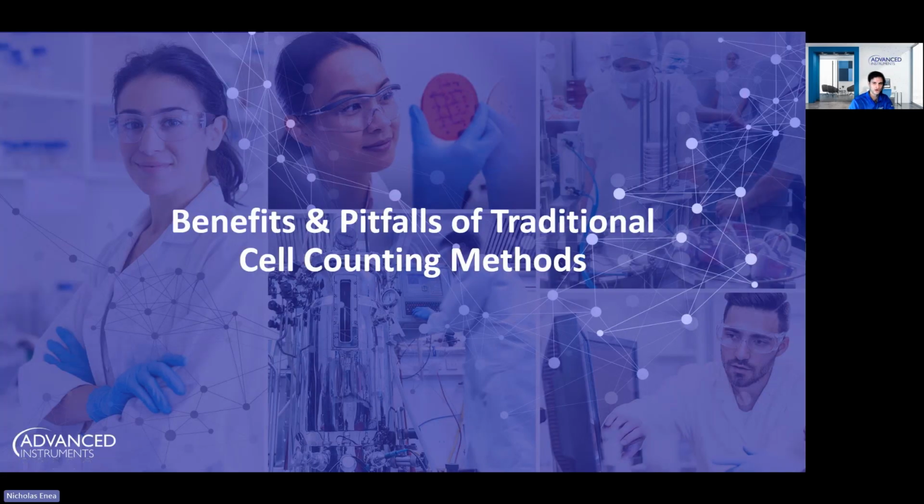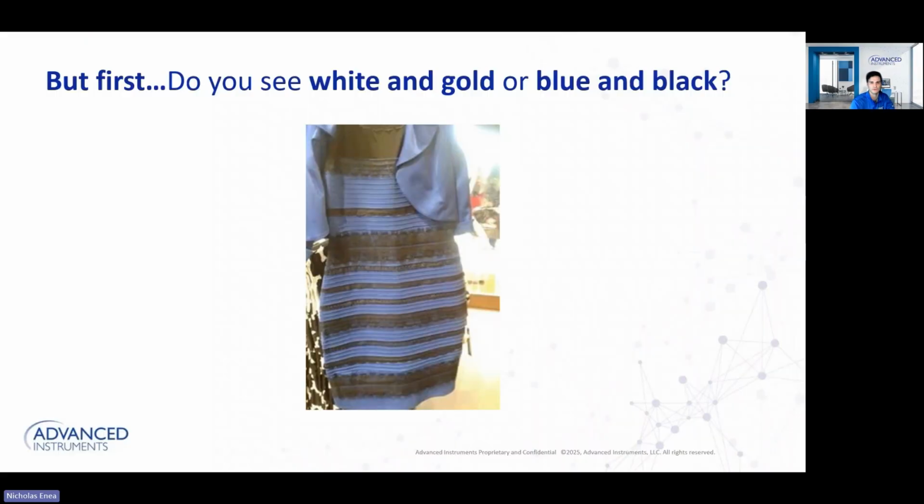Okay, let's talk now kind of the meat of this presentation and why we're here today, right? In a lot of the hospitals that we're probably in right now, you're using some of these methods. What are the pitfalls of the methods you're using, and how can the GloCyte help you here? I always like to do this activity because, and you're going to see it's a little kooky, but it's going to illustrate a point in a second, right?